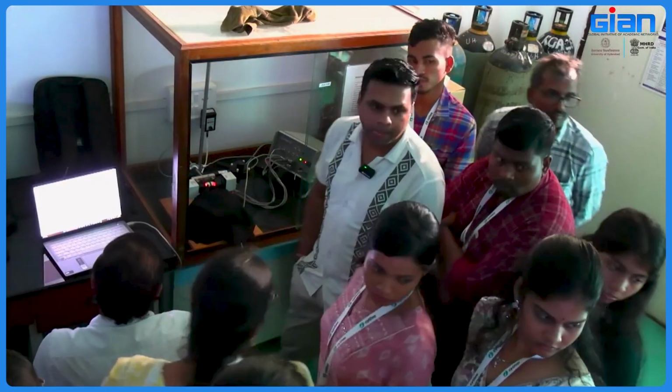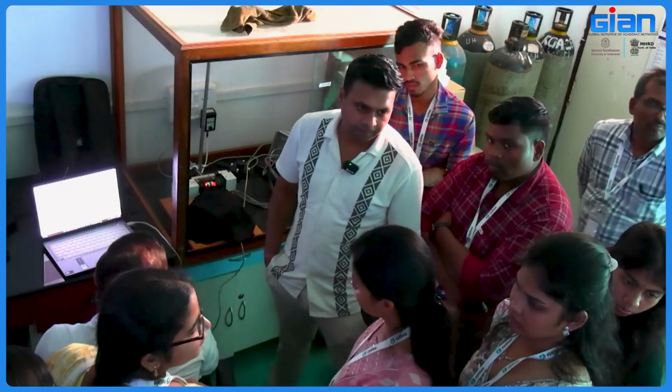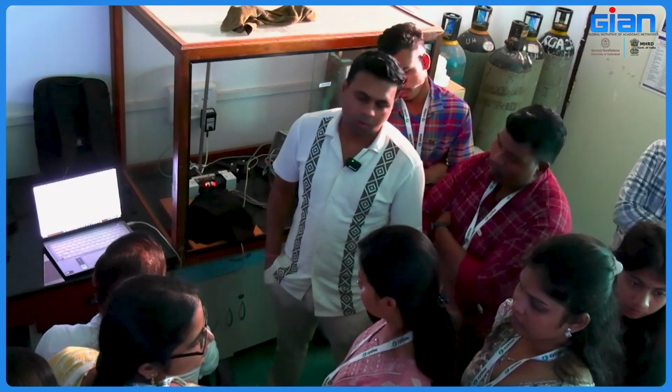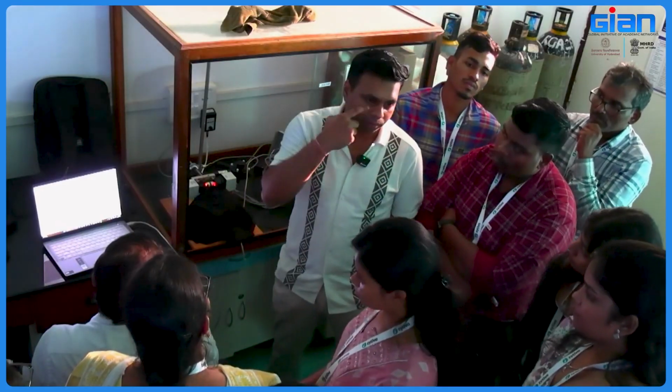And I have one more doubt. We are taking Fo in the start. After that, the probe or the measuring light is already on, right? So we have a little bit of light. So the Fm would be affected because... No. Measuring light does not affect your Fm. Your saturating pulse will record your Fm.